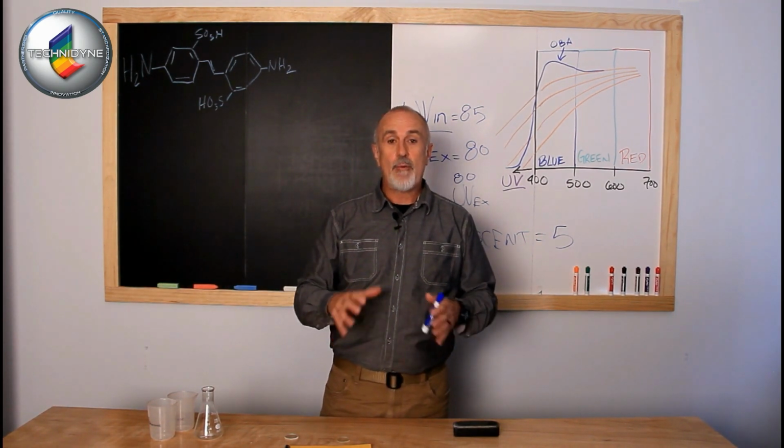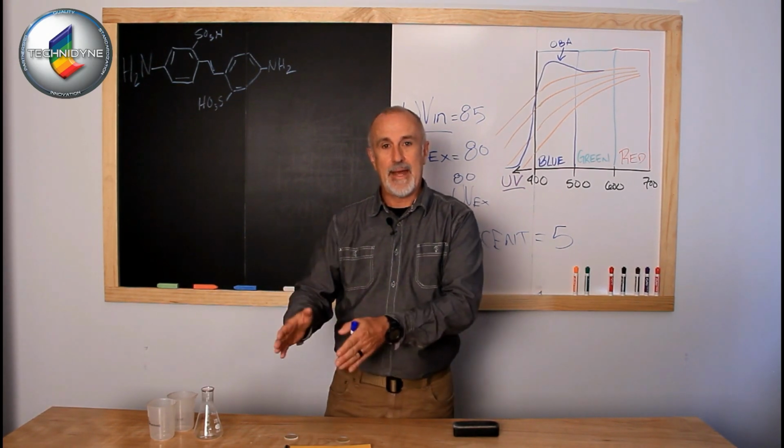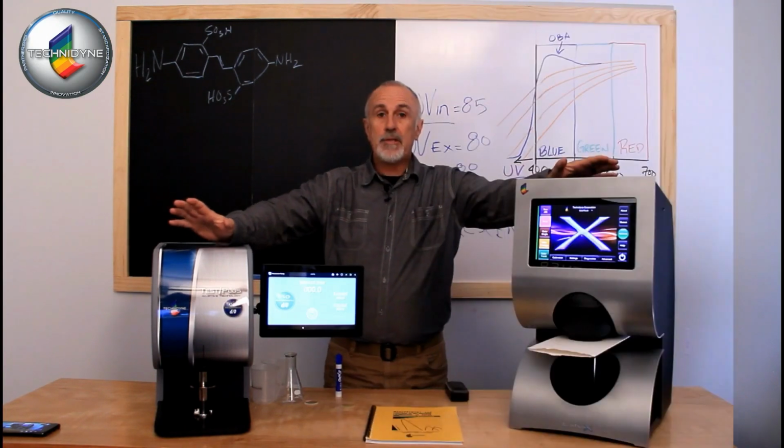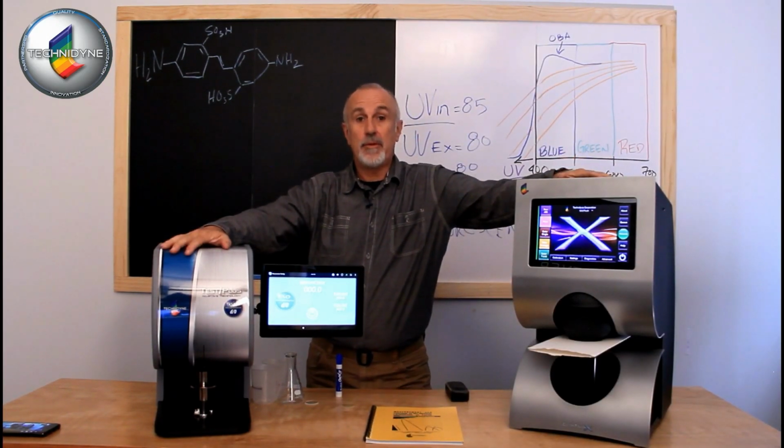All right, so now we're going to break that down for TAPPI and ISO. For the rest of this video we're going to talk more specifically about how ISO handles the measurement of fluorescence.